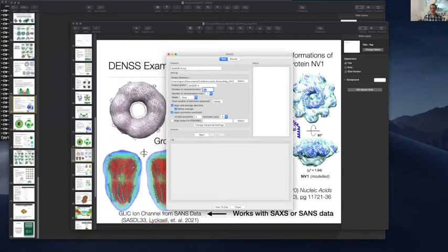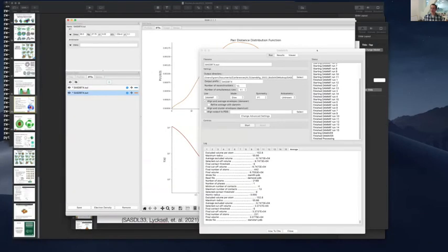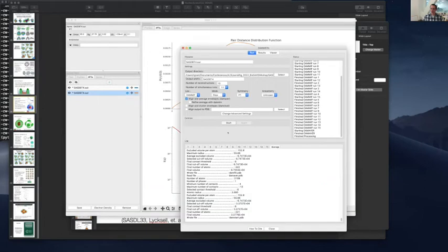And I'm going to also show you, since it's very similar, how to run bead modeling, which I also ran. So again, you just click on the IFT, and when you right click on it, you have the option for bead model or electron density. So rather than clicking electron density, you would click bead modeling, okay? And that'll pop up this window. Mine was already run, so it's filled in with stuff, but yours will be blank here.